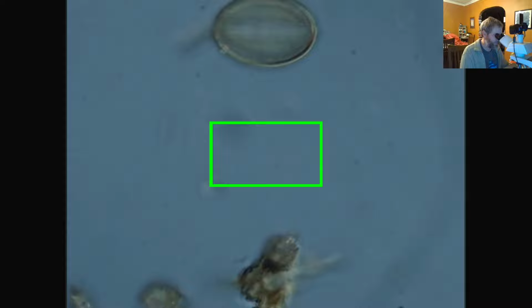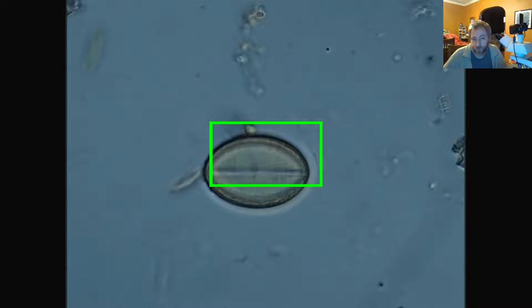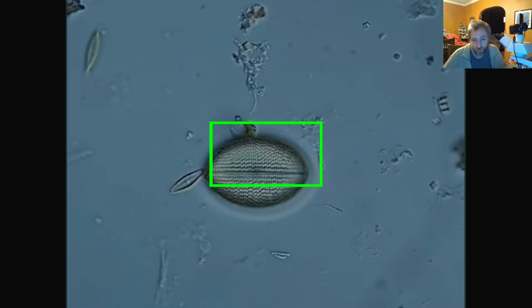And then these things, which I mentioned that we saw, a bunch of Cocconeis, that are here, usually grow on plants. So it indicates that there's shallow water nearby with a bunch of plants. So I'm assuming they're probably aquatic plants that are growing in the waterfalls or adjacent to the waterfalls on the rocks, and these things are attached to those. So pretty good interpretation skills.